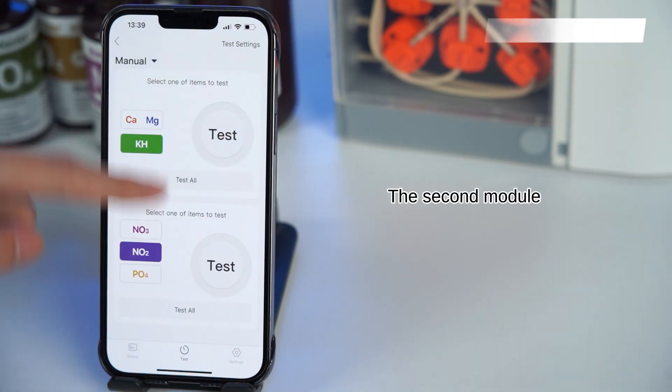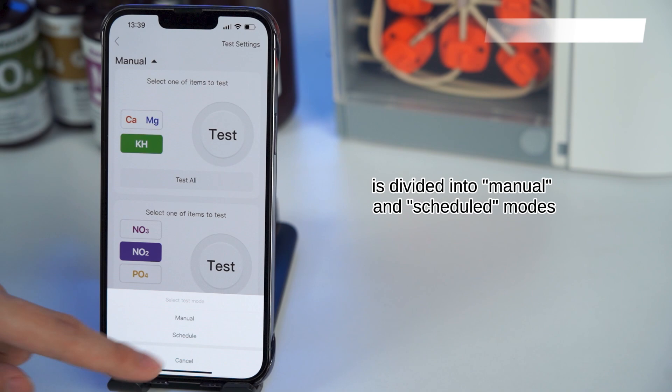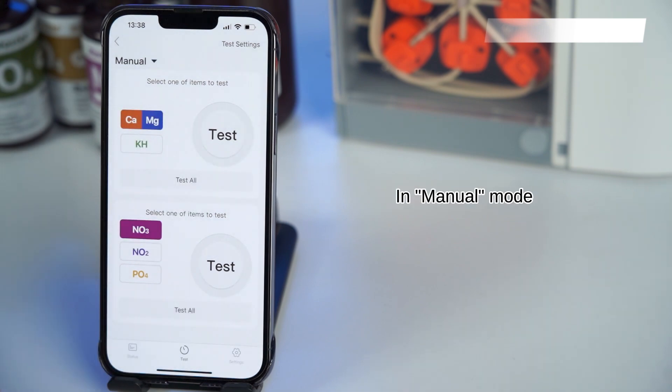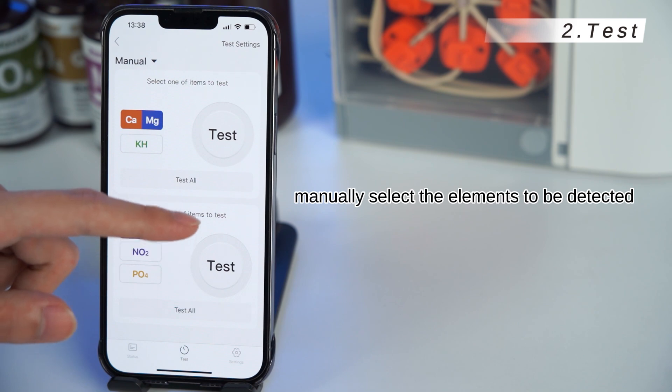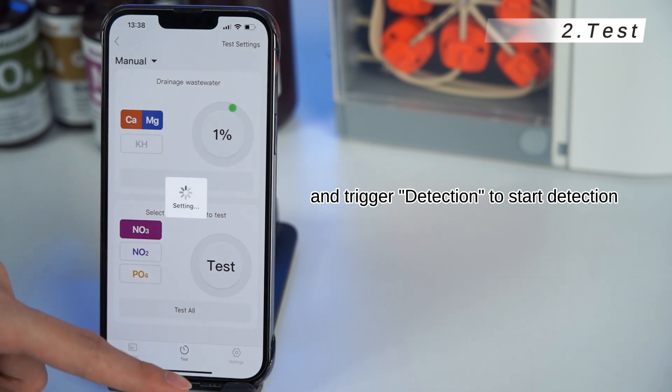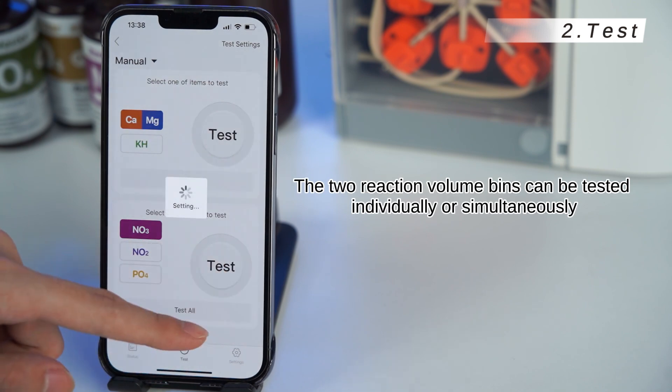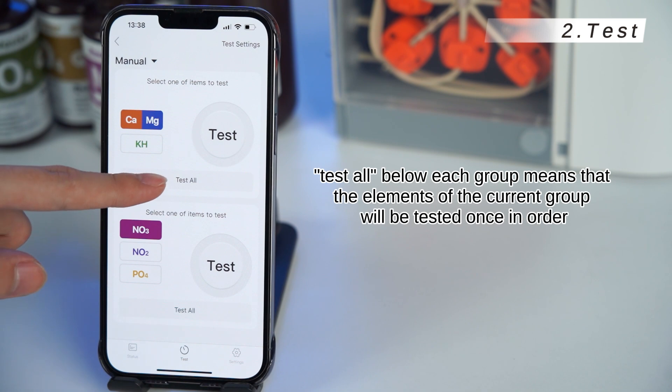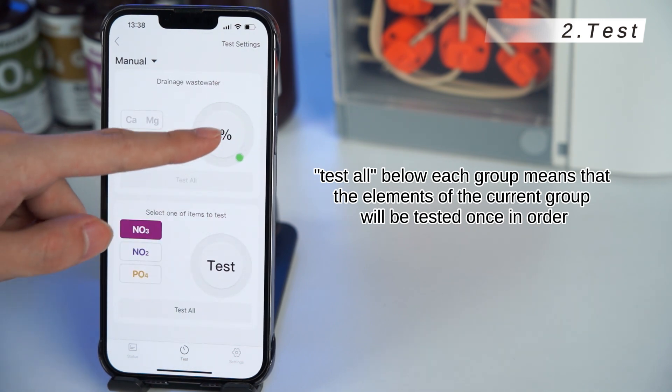Test. The second module, test, is divided into manual and scheduled modes. In manual mode, manually select the elements to be detected and trigger detection to start detection. The two reaction volume bins can be tested individually or simultaneously. Test all below each group means that the elements of the current group will be tested once in order.